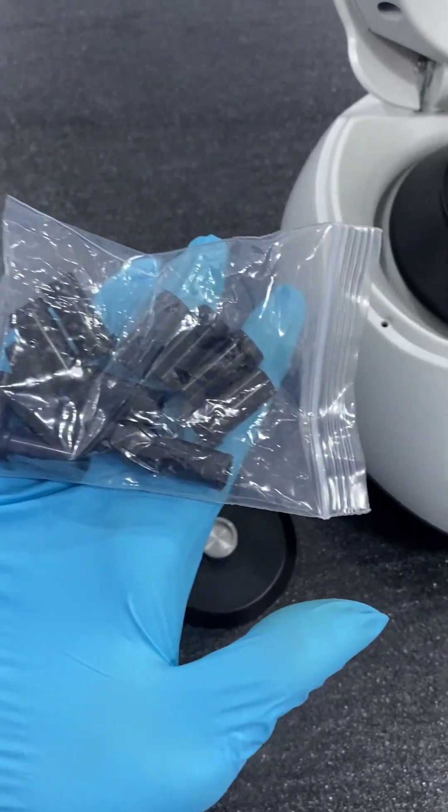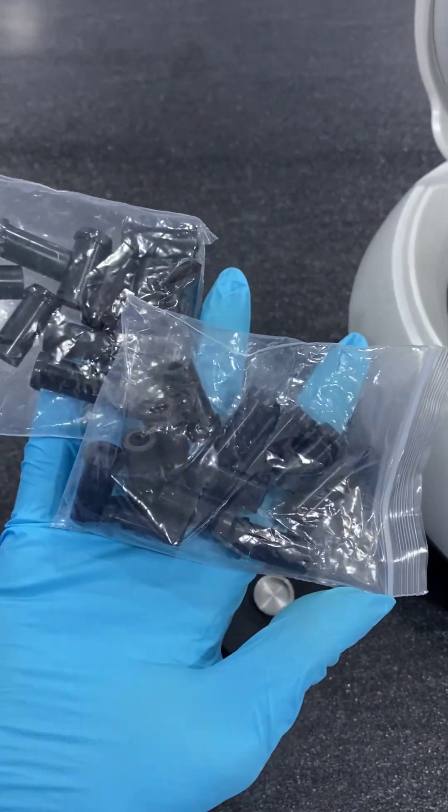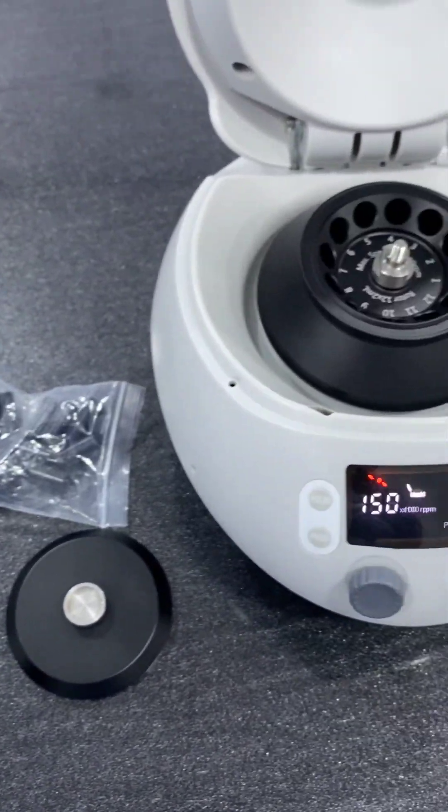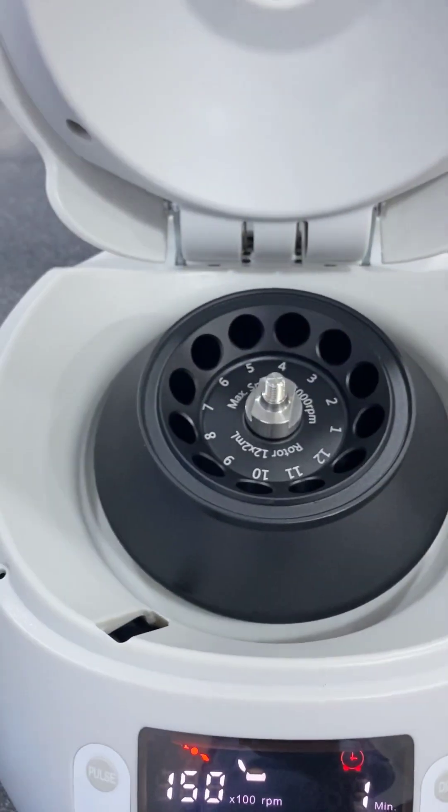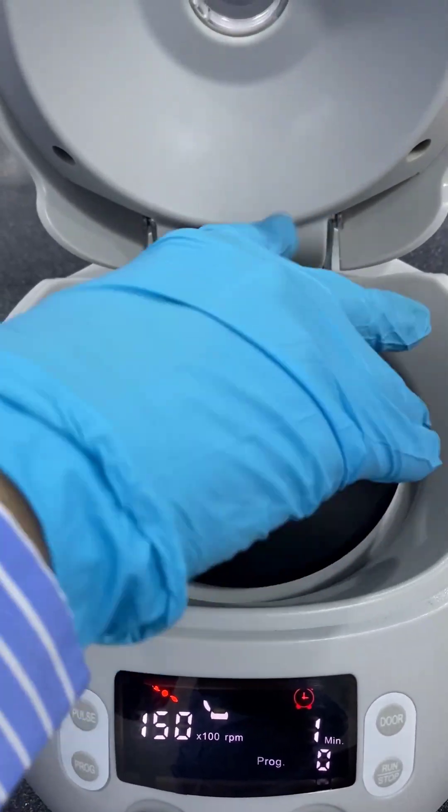Adapters for 0.5 ml and 0.2 ml tubes also come along with this machine. After inserting the centrifuge tubes, lock the rotor with the lock rotor lid.